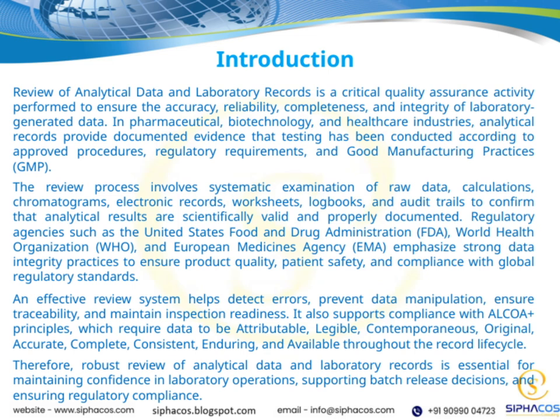Ultimately, a robust review process is essential. It helps us maintain confidence in our laboratory operations, supports sound batch release decisions, and ensures we stay in compliance with regulatory requirements. It's a fundamental part of delivering safe, effective, and high-quality products to patients around the world.